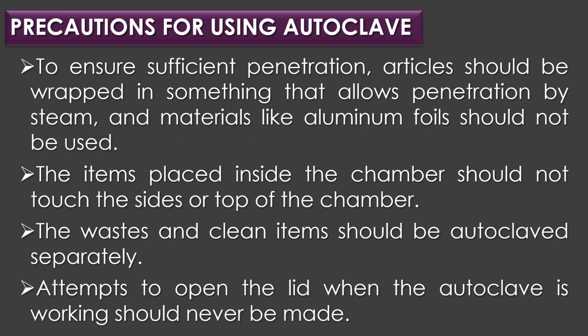To ensure sufficient penetration, articles should be wrapped in something that allows penetration by steam, and materials like aluminum foil should not be used. The items placed inside the chamber should not touch the sides or top of the chamber. The wastes and clean items should be autoclaved separately. Attempts to open the lid when the autoclave is working should never be made.